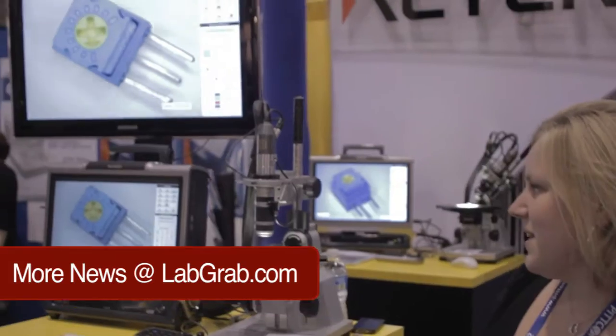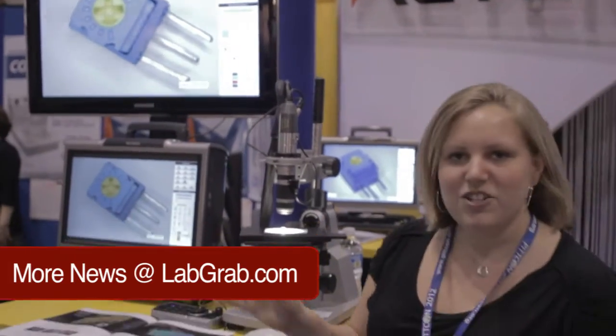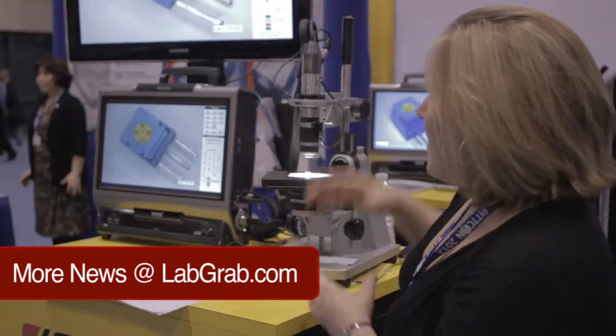Hi, I'm Julia. I'm here with Keyens. We've got our digital microscopes here. This is the VHX-1000. It's going to be an all-in-one unit.